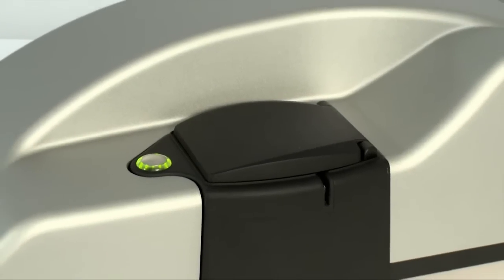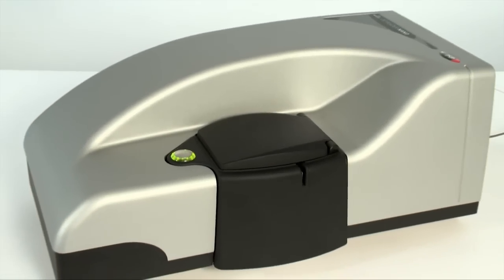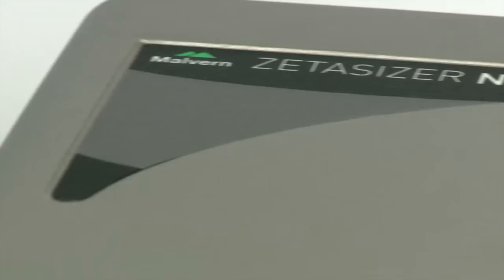The Zetasizer Nano ZSP is a new premium addition to the Zetasizer Nano range. This video demonstrates a new microrheology measurement type that is available as an option.